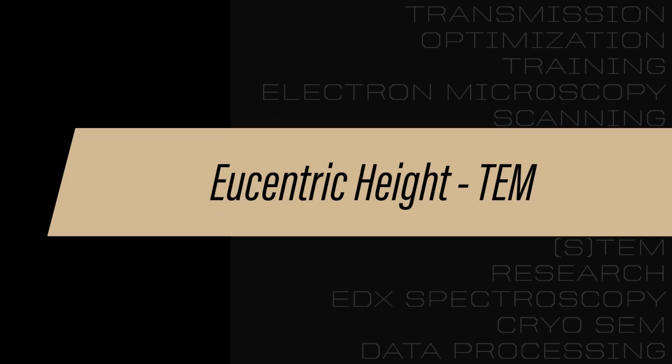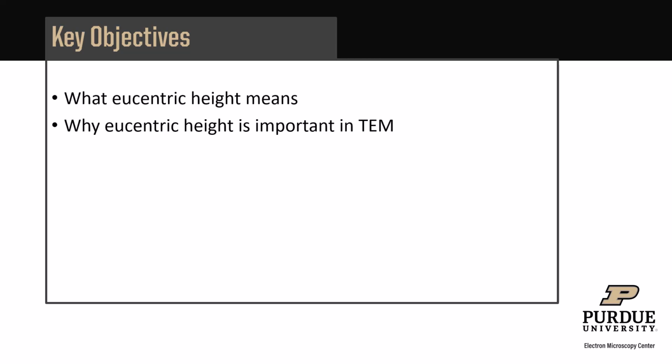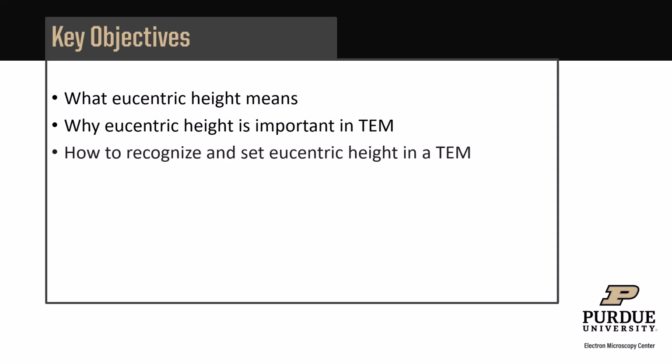The topic for today's training video is eucentric height in a TEM. In this video, we're going to explain what eucentric height means, why it's important in a TEM, and how to recognize and set eucentric height properly.